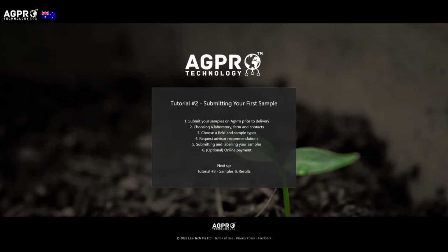AgPro labs offer a wide variety of tests, from soil, plant or water testing, through to livestock nutrition and genomics. In this tutorial, we'll walk through the process of submitting a horticulture SAP test. You may be interested in looking at our sample planner tutorial for bulk sampling.